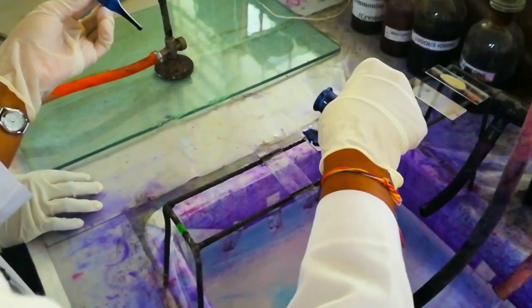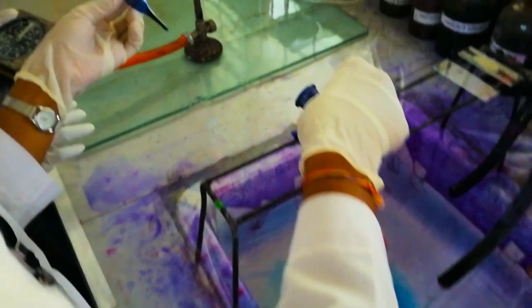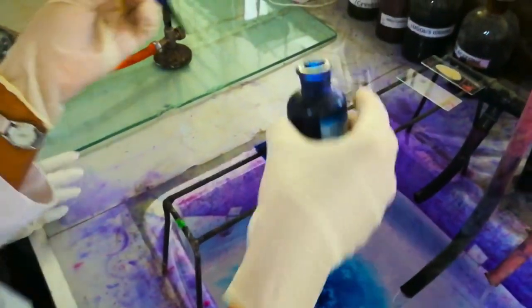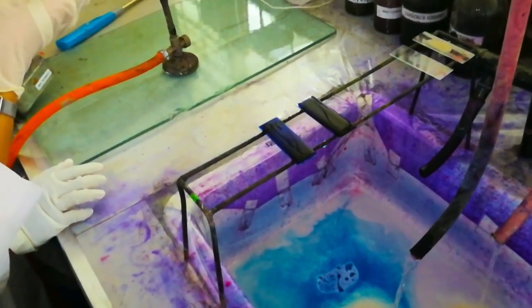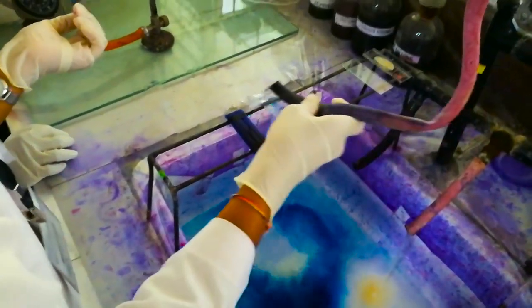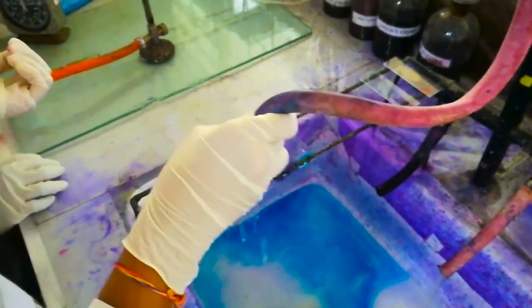Apply 0.1% methylene blue on the slide. Allow to stand for 30 seconds. Then gently rinse the slide with tap water and tilt the slide to drain off the water.